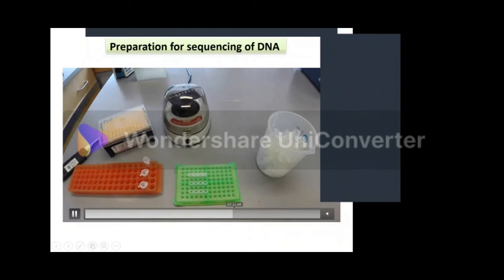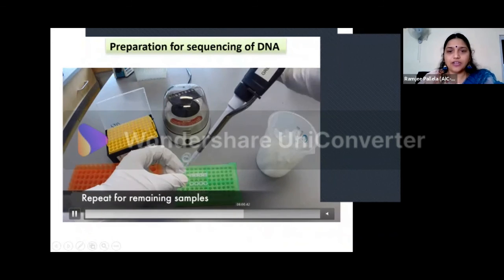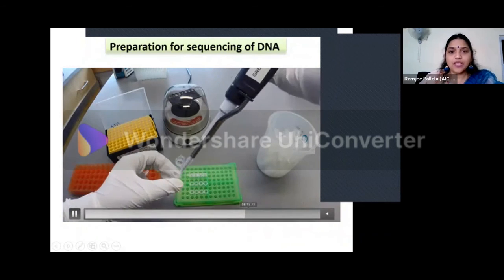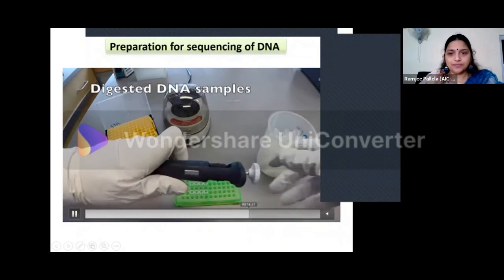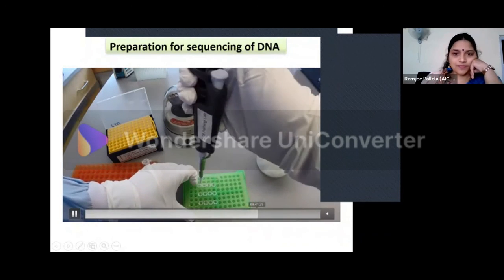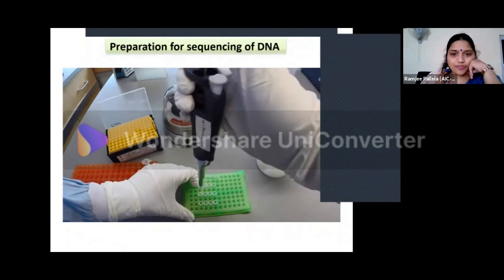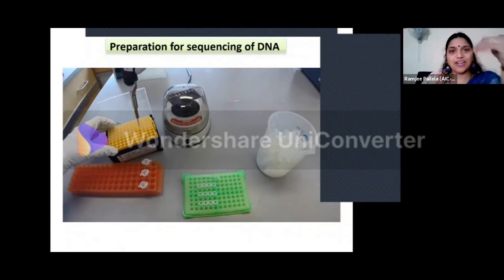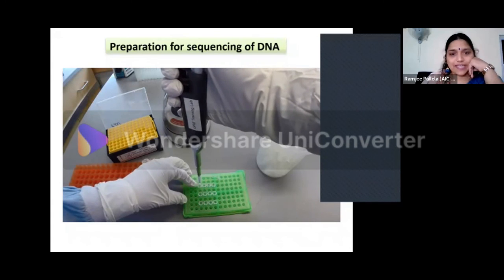Yeah. So we are adding the molecular grade water, and we are doing it for all of the samples that we have added, and we have purified them. Now our samples are ready together with the water for sequencing. Mix everything very thoroughly. Now here you can use the same tip because you are not going to do it separately. So you can use the same tip for different triplicates.